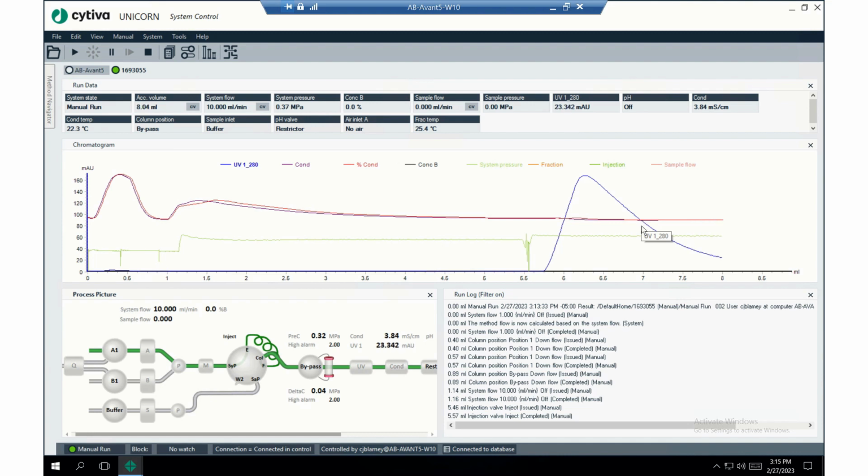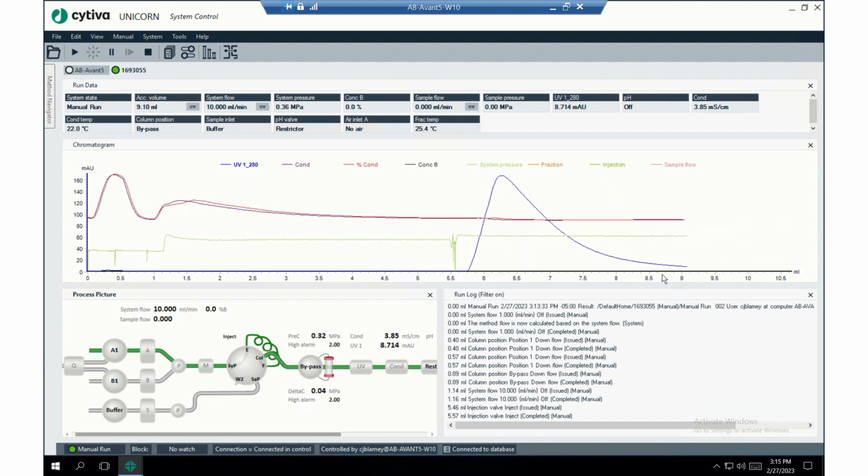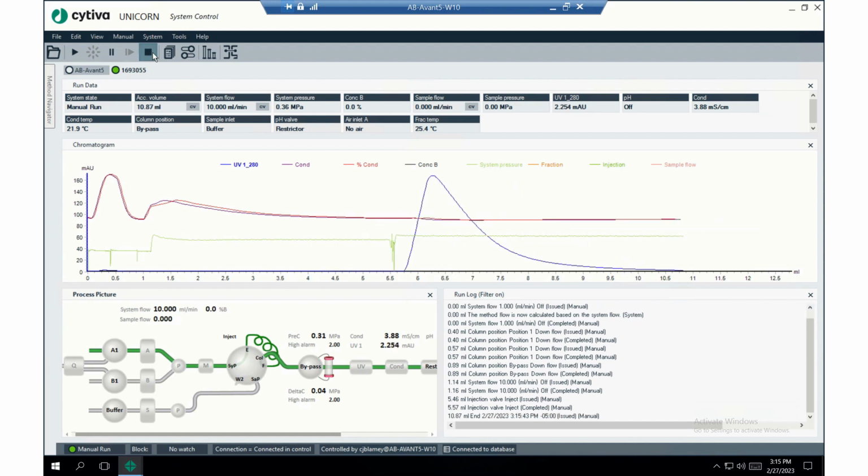So it's a 5 mL loop. We started at 5.5 mL. We'll just let that run until it gets to 10.5. Okay, I'm going to stop the run now.